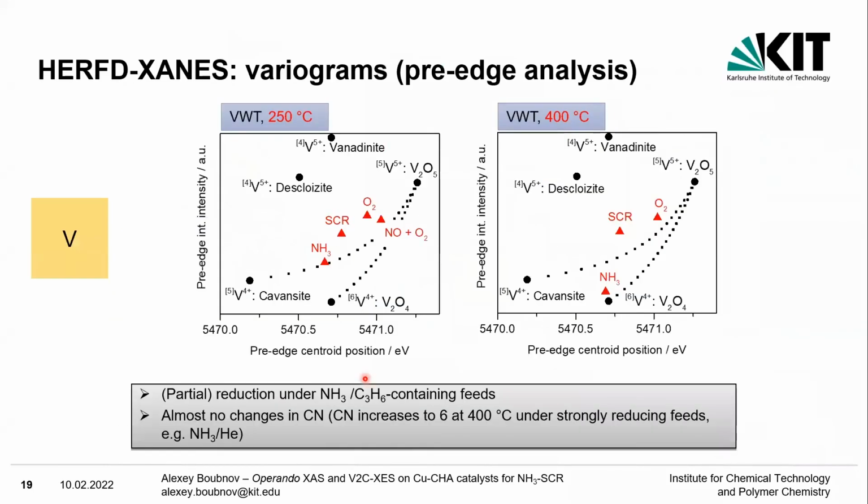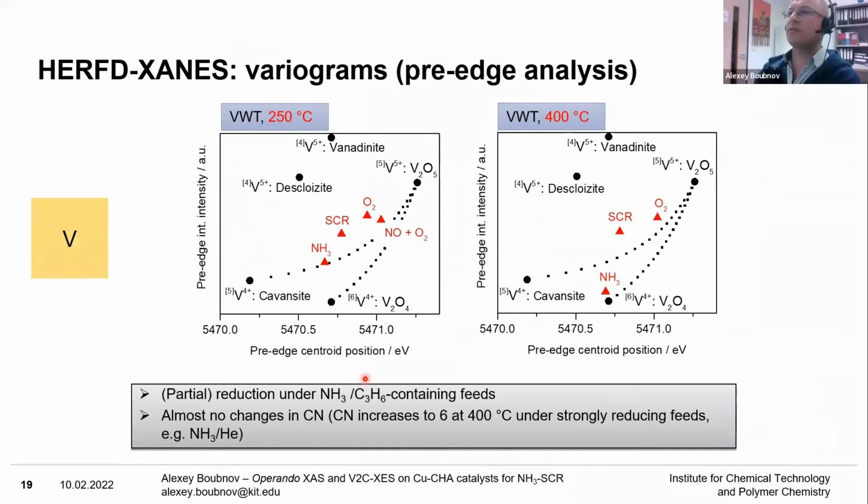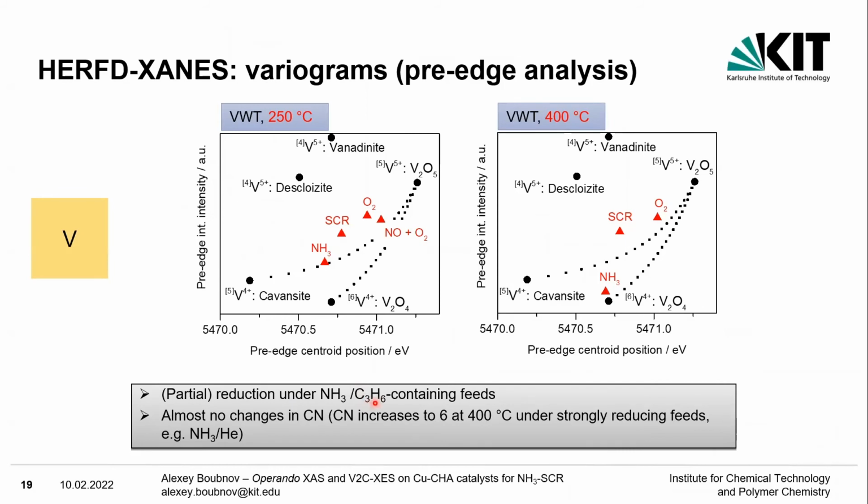Yes, that's right. The estimation of the oxidation state and the geometry. So which reference compounds are you mostly referring to? It seems most of your spectra under reaction conditions in red are sort of in the middle. They're between the 4+ and the 5+ references.